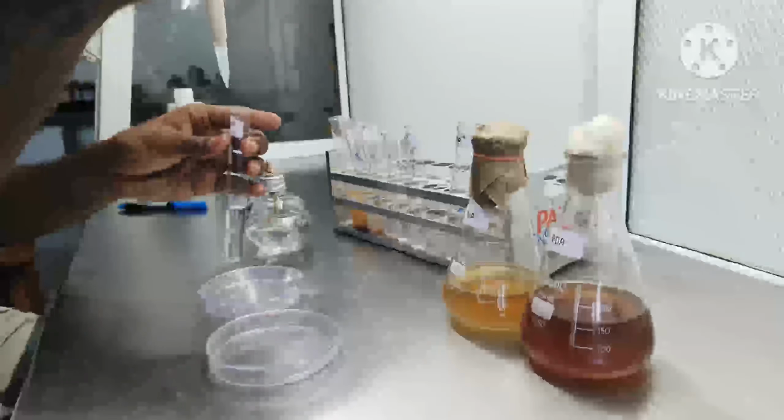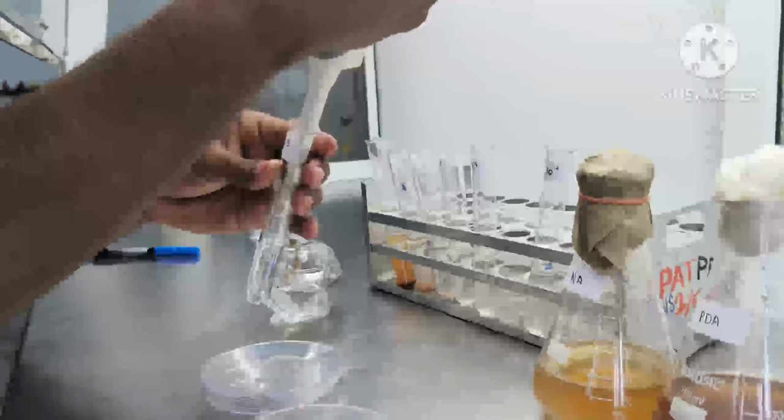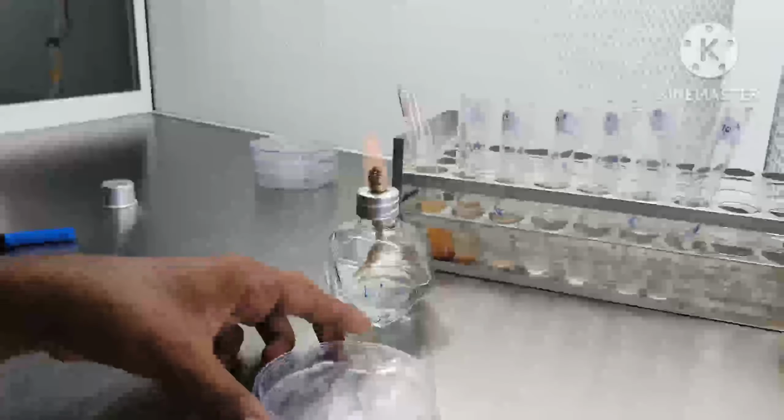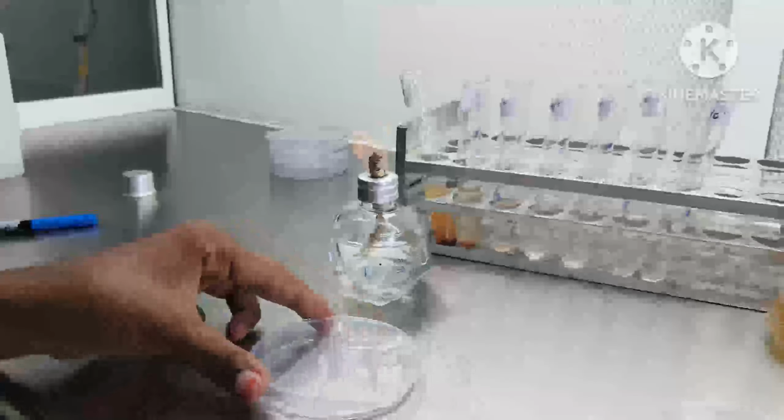Test tube containing 10^5 dilution was used for the isolation of fungi. 1 ml of suspension was taken and was transferred to a disposable sterile Petri plate. The plates were then rotated in clockwise and anti-clockwise direction for the uniform distribution of sample.